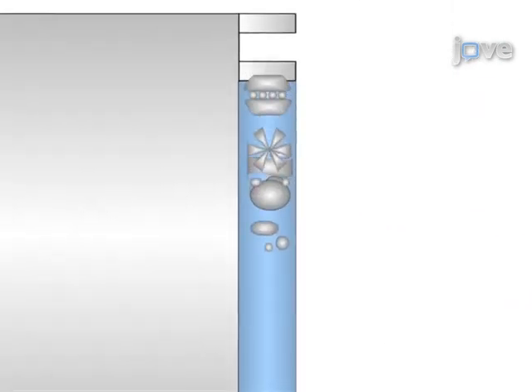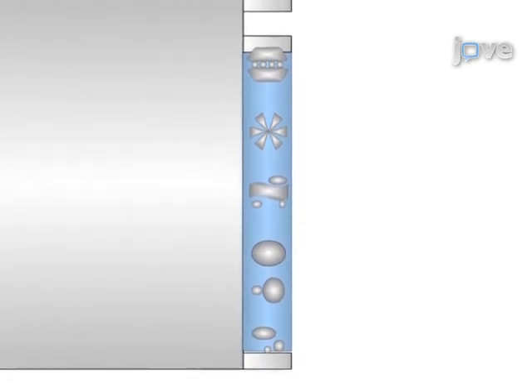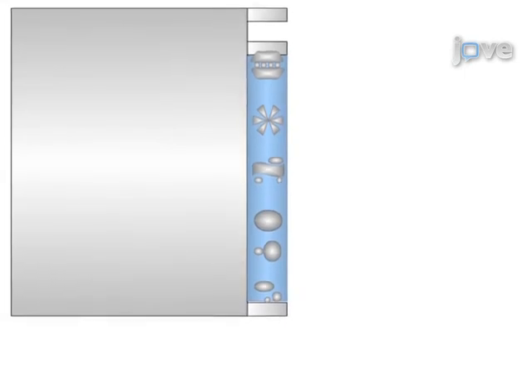As a second step, the lysate is applied to first dimension blue Native-PAGE, which separates protein complexes under native conditions according to their size and shape.